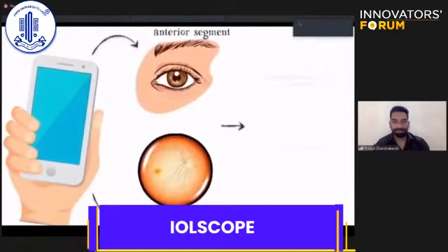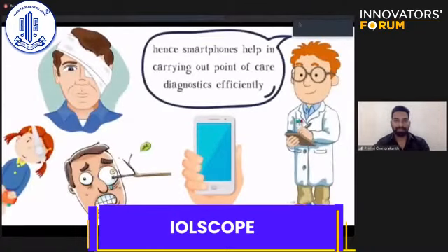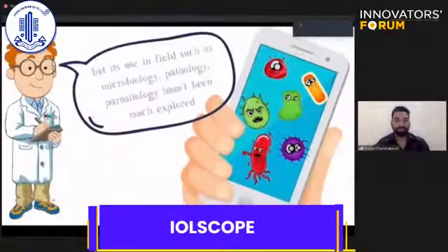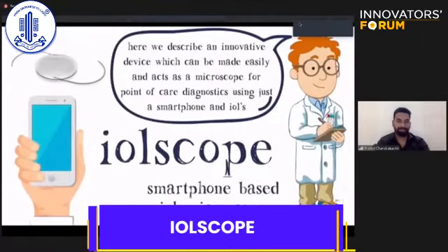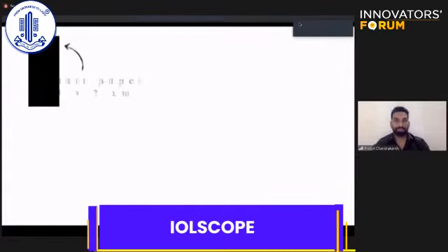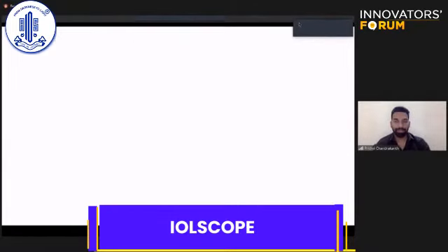Smartphones are being used to acquire anterior and posterior segment photographs with impressive details, which established it as a good tool for point-of-care diagnostics. Its use in fields such as microbiology, pathology, parasitology hasn't been much explored. Here we describe an innovative device which can be easily made and acts as a microscope for point-of-care diagnostics using just a smartphone and IOLs, called the IOLSCOPE. It is required: chart paper 4x2 cm, intraocular lens 30 diopters for 4 numbers, micropore, paper puncher and liquid adhesives.